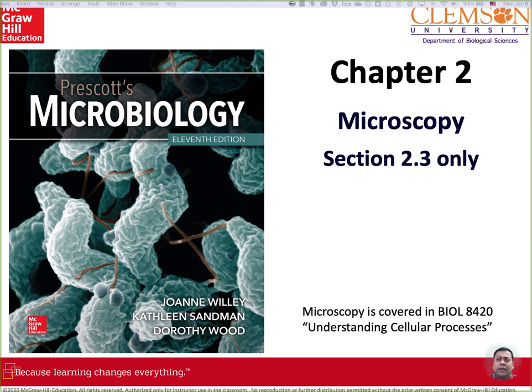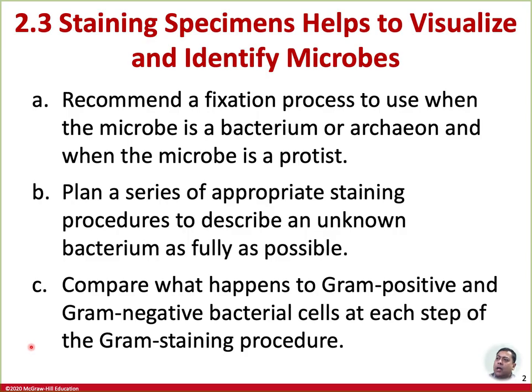So the first thing that we are going to understand from this chapter is that staining specimens helps to visualize and identify the microbes. So essentially, when bacteria, archaea, or any of the microbes are present and we need to visualize them under the microscope, we need to stain them. Before staining, we need to fix them. We are going to talk about what the fixation process is.